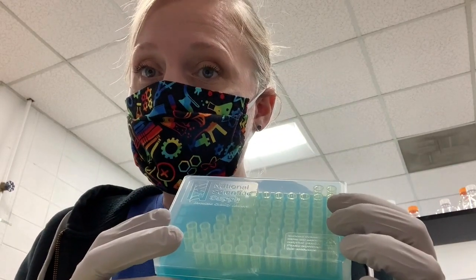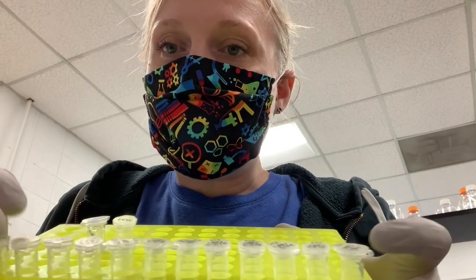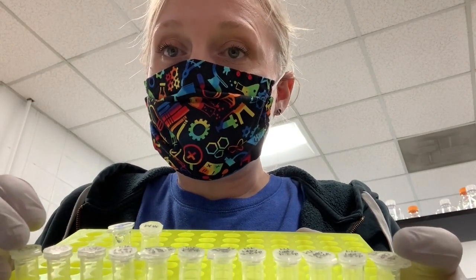I have 12 samples here, and remember, for this protocol we're going to be using these filter tips, which are RNase free. So I have in front of me a tube for my master mix, my high yield transcription buffer, and then my double-stranded RNA synthesis reactions that I've taken out of the 37-degree incubator. So I'm going to combine the reagents for my DNase treatment. First, I'm going to add water.